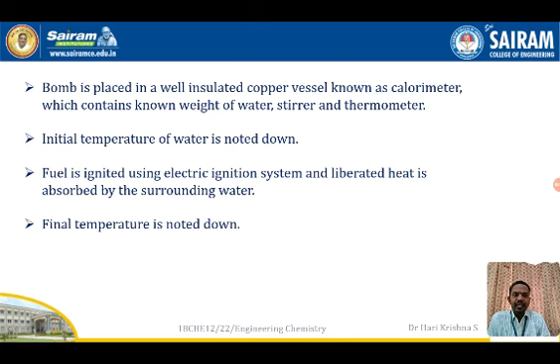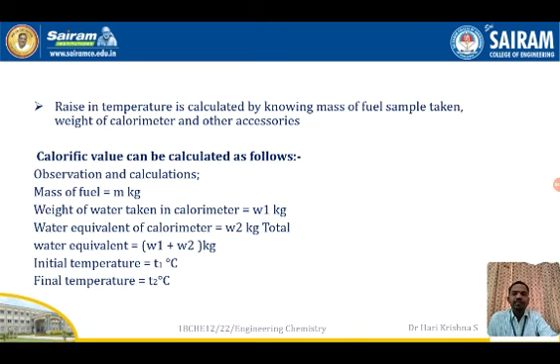Once the temperature rise is constant, we note down the final temperature, and the difference in temperature is calculated. By knowing the mass of fuel taken, the rise in temperature, the weight of water taken in the calorimeter and also the weight of other accessories in the calorimeter, the calorific value of the fuel can be calculated as follows.